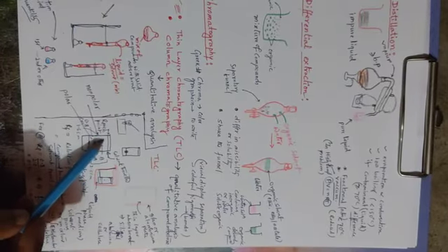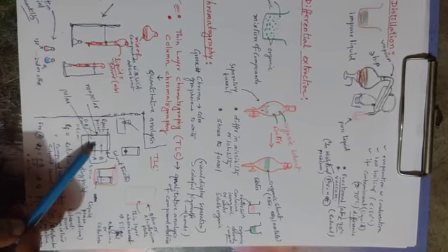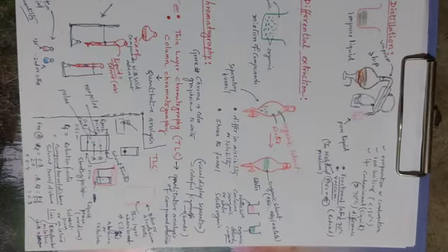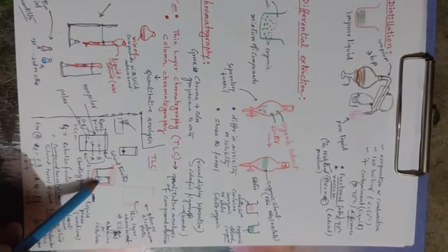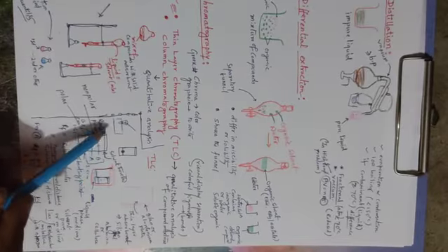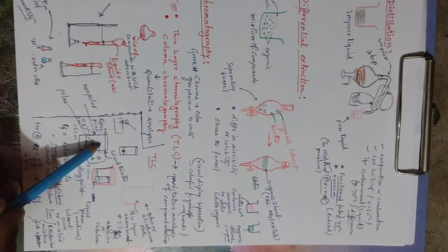That means this is a little non-polar compound which has less binding affinity towards the adsorbent, and this one has more binding affinity, so it is a more polar compound. Now this is the base point, called the starting point. From here the solvent moves to this point, the solvent reach point, and compound A reaches here and compound B reaches here.